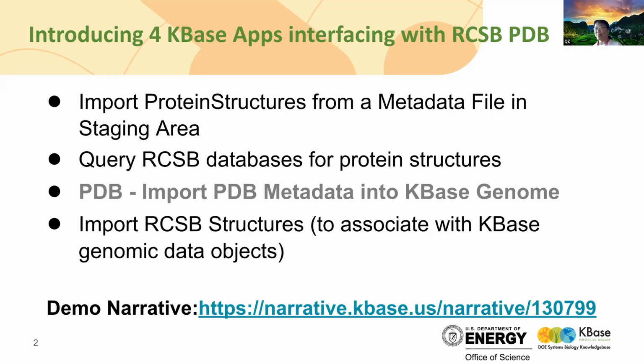KBase saves data into objects instead of files. But this app will take a CSV file as a metadata file to define which data the user wants to link his or her KBase data with the RCSB structures. So that's the first app.